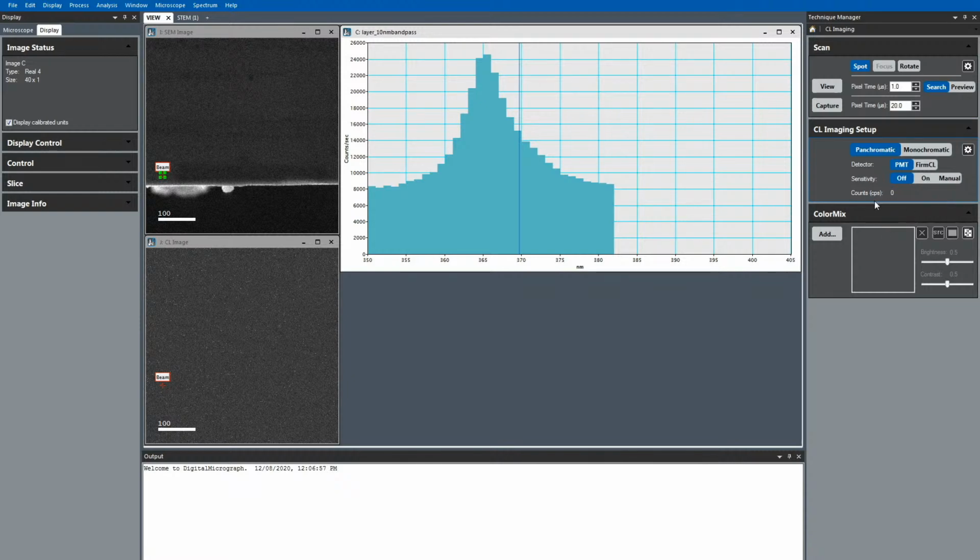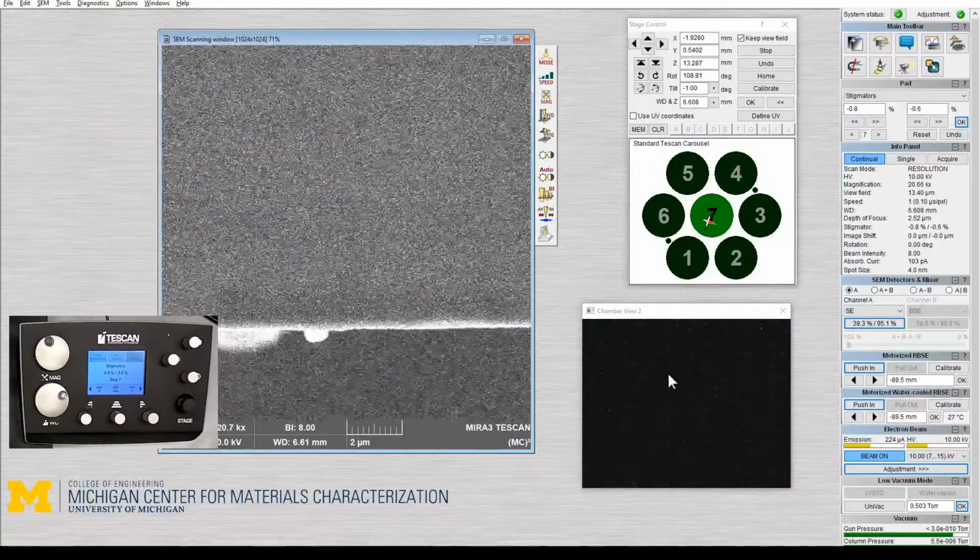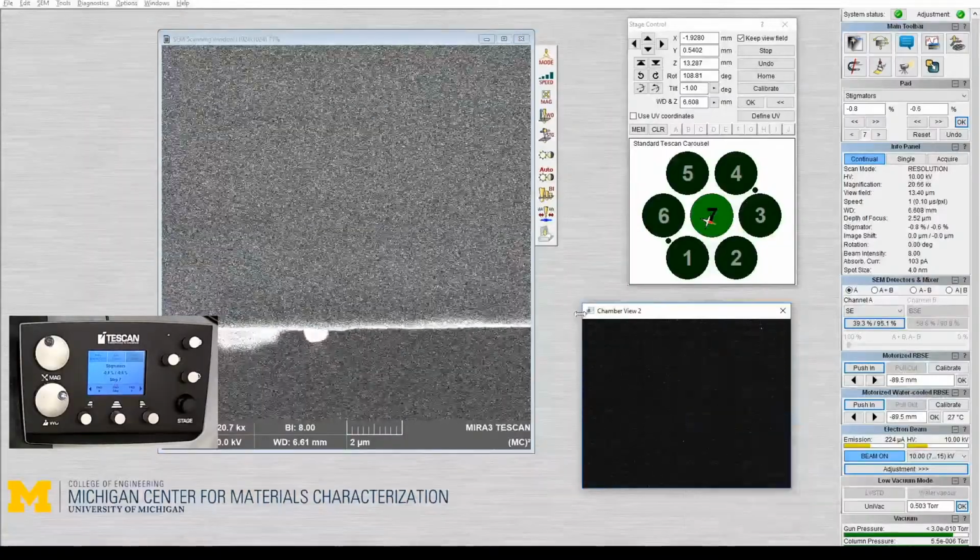Even with the shutter closed, you get some light through it, so you may have some signal here. And also, high tension on the photomultiplier generates noise as well, so you could see counts that are just noise. But we want to see that to be 0. So right now, high tension all the way counterclockwise, flip the switch, turn it off. And now I can turn the IR LED back on.